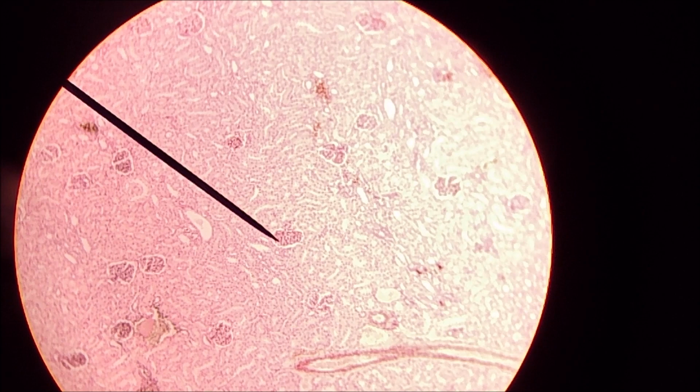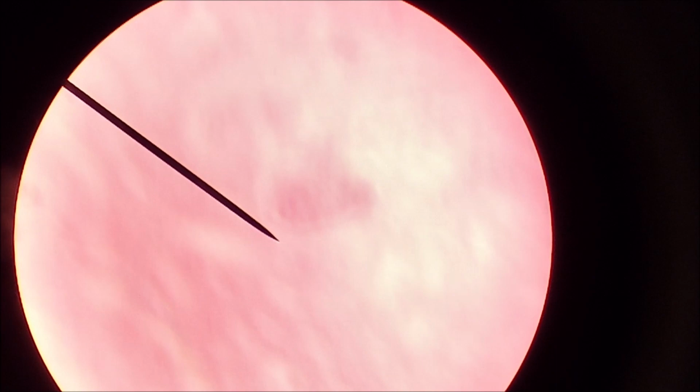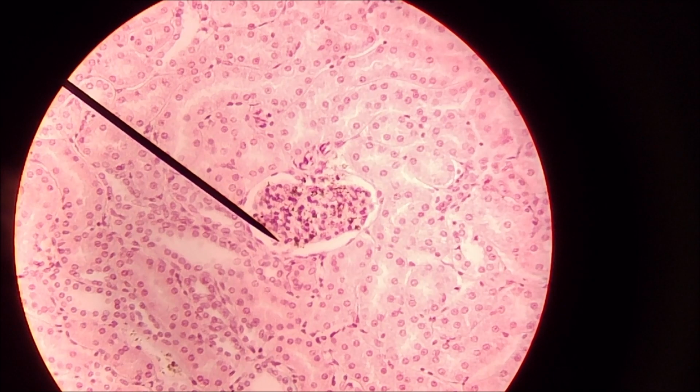So I can zoom this in a little bit more. And there is a nice glomerulus right there. Here's another one, here's another one. There's one. They're all over the place. And if I zoom in just a little more, let's get a little focus here. There we go. What we see there is a nice glomerulus. So the glomerulus is obviously the structure in the middle here, and it's inside of an opening called Bowman's capsule, and the squamous epithelium lines this.